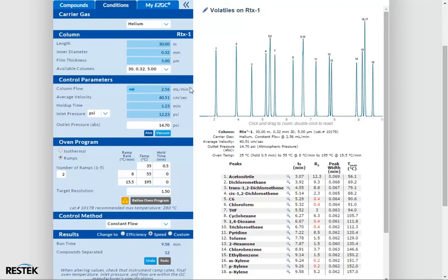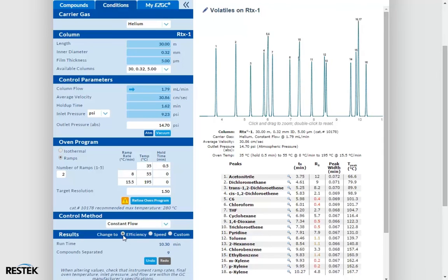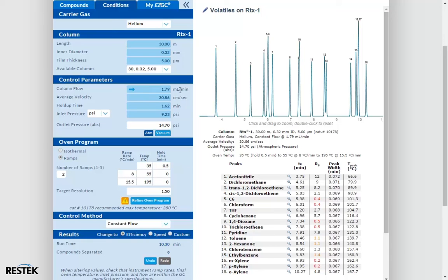If we click the efficiency button, we can see that our flow is reduced down to 1.79 mls per minute. This flow rate is at the absolute optimal flow rate for this column dimension with helium carrier gas. So why is it that the resolution between toluene and 2-hexanone decreased when we switched over to a more efficient flow rate?